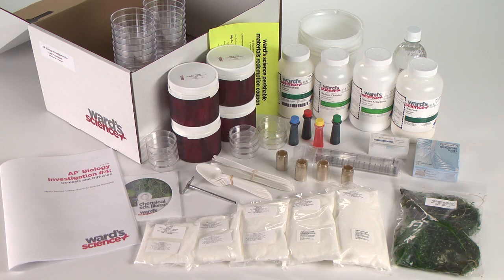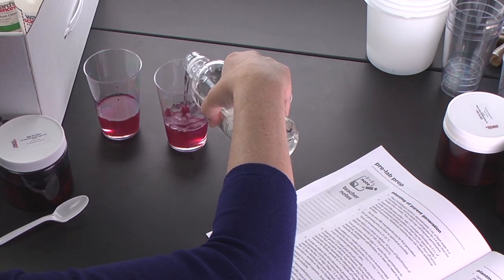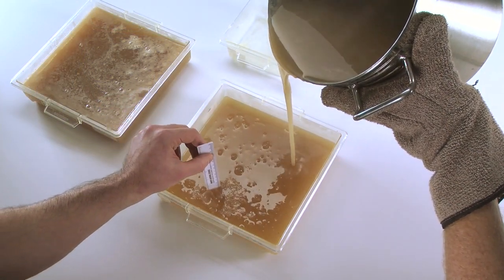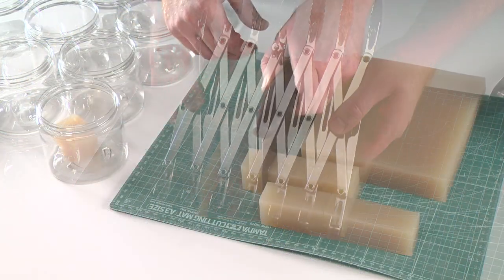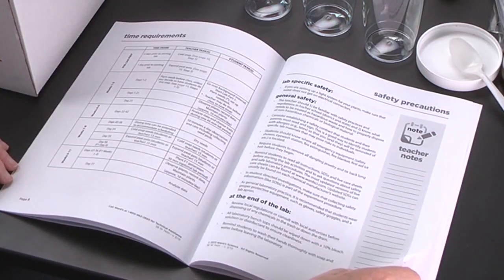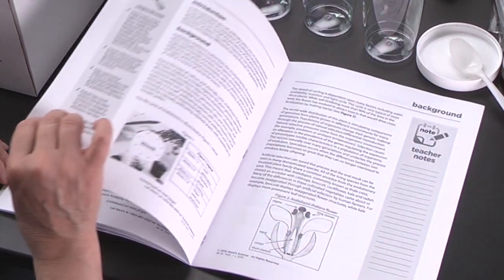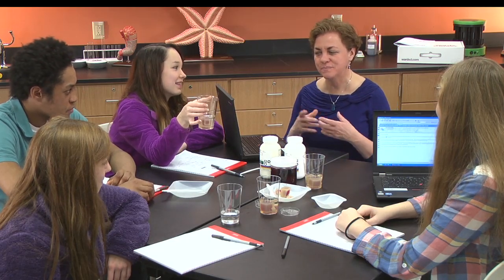Materials are pre-organized, pre-sorted, and ready to use right out of the box. With clear teacher instructions included in every kit, set up is a breeze. We've even taken the time to prepare materials in advance whenever possible, like our exclusive ready-to-use agar cubes included in AP Biology Investigation 4. Because we know how important it is to save time in your lab, we've taken the extra steps to connect you to time-saving solutions in all of our kits, so you can spend more time connecting your students to key AP Biology concepts.